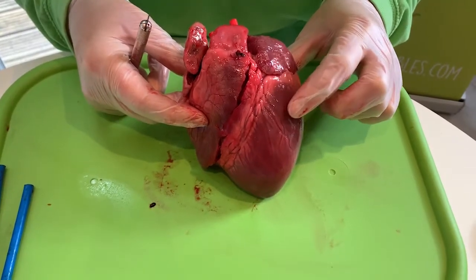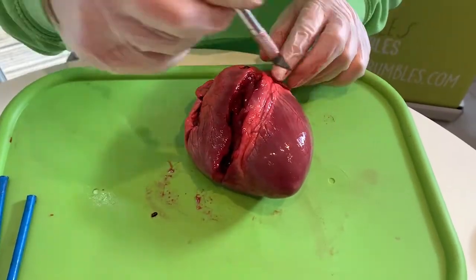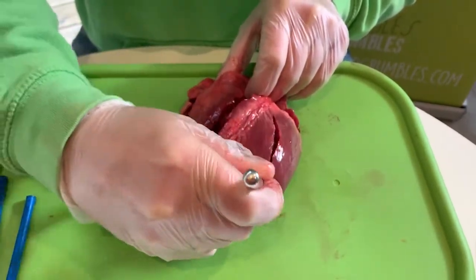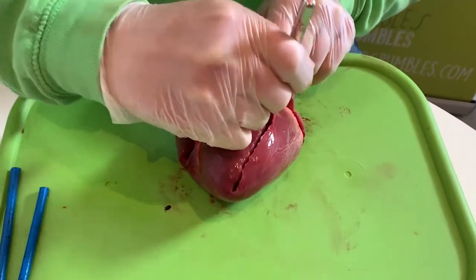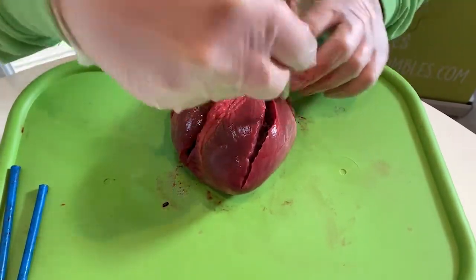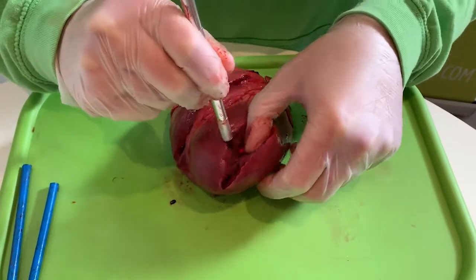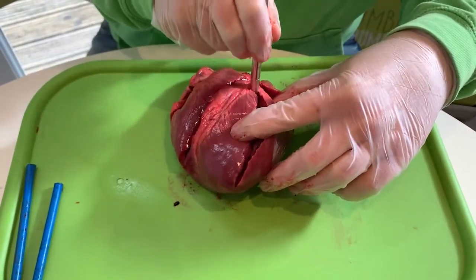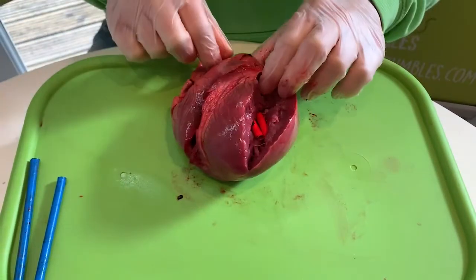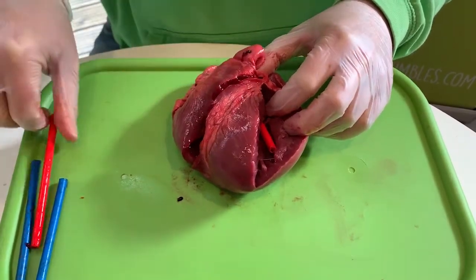Now let's have a look at the left side, the thick left side that takes blood all around the body, and see if we've got our two red oxygenated straws in the right place, okay? So let's cut down here into the muscle. Now that is much thicker, much harder to cut into. Let's have a little look. Open that out to cut a little bit more. Okay, now we are in the right place, definitely in the left side of the heart. So that's the two red straws and the oxygenated blood. So let me take those out.